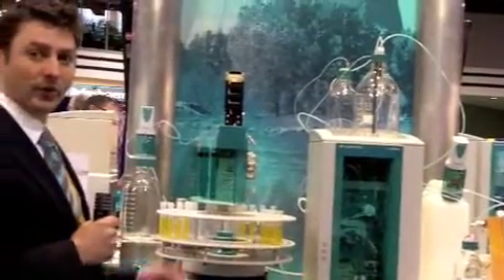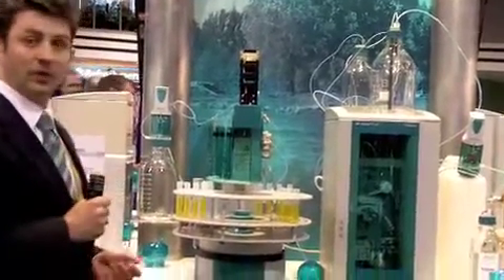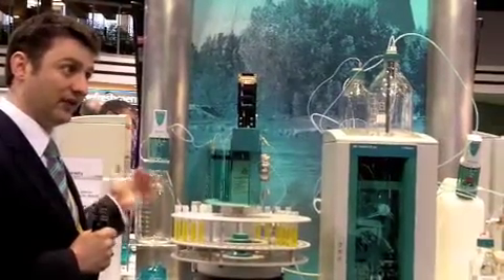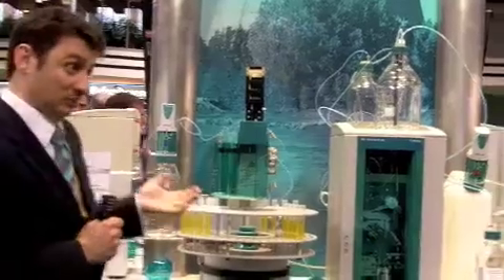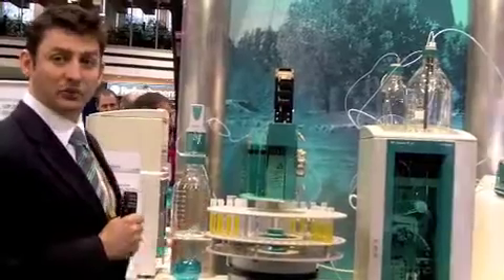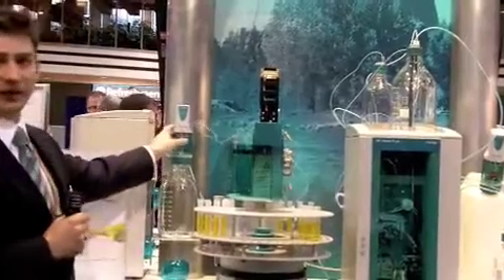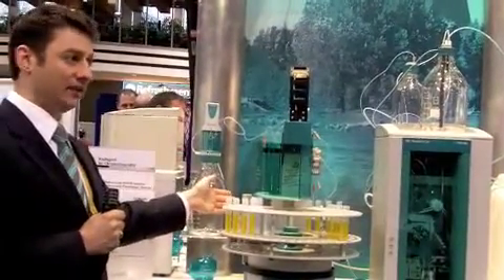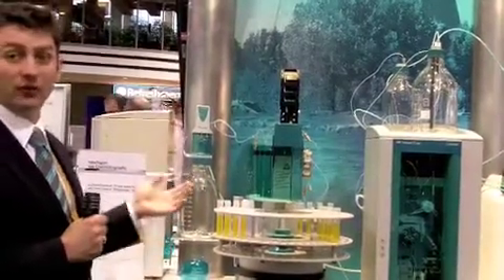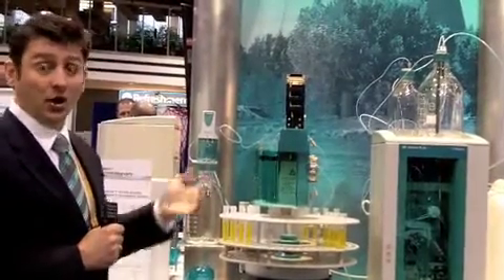Now I'll talk about the inline dilution and inline calibration. For example, if you wanted to calibrate with this system, you would place a single standard in position one on the sample processor. Let's use a 100 ppm anion standard as a generic standard. You would then place empty vials into positions two, three, and four — however many standards you wanted to prepare. We would then use this dosing device on the side of the instrument to take a small volume of standard, dispense it into the empty vial, and add the appropriate amount of water to make different level calibrations. So from a 100 ppm standard, you can make a 1, 5, 50, and 100 ppm calibration.